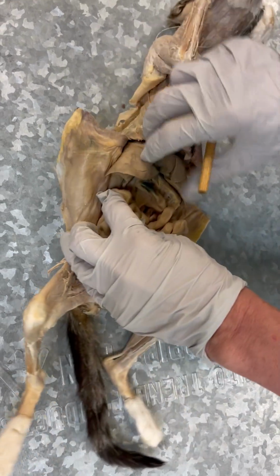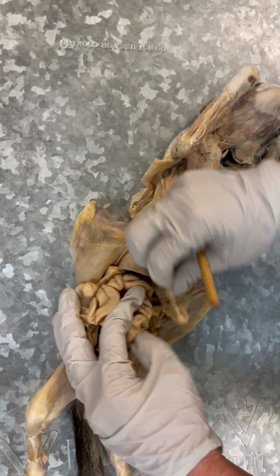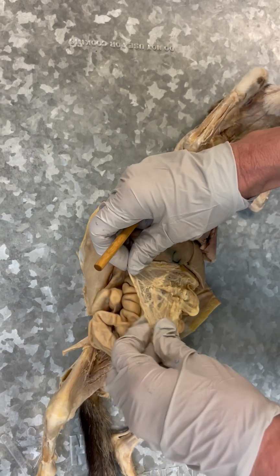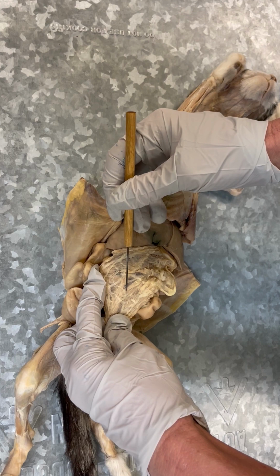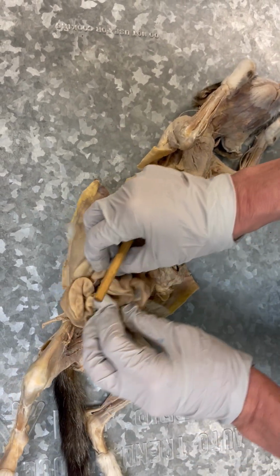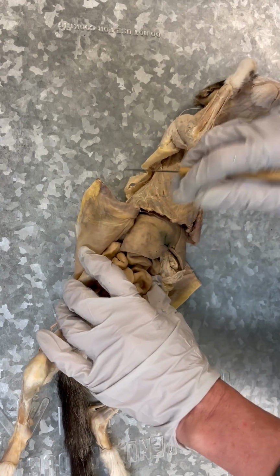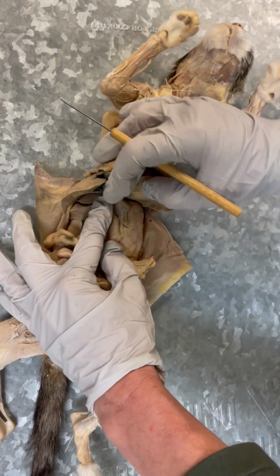When you come over here, this cat has a very, very small greater omentum, rather. And what it does is it produces serous fluid because these intestines are able to be in motion. The omentum is connected to the stomach.